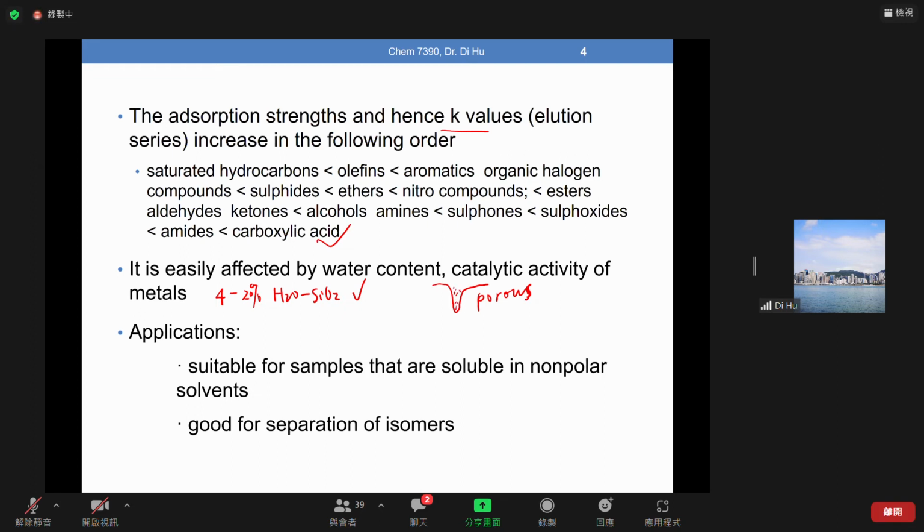The water fills some of the very fine pores and prevents some of the mass transfer into the stationary phase, and that helps to lower the C term, right? Because it's not really necessary to diffuse in.